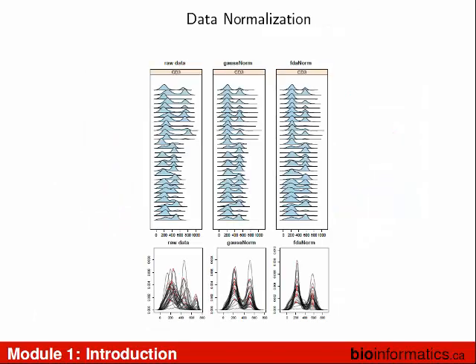So this is kind of how it looks. Again, not showing any code. You have to trust me that the math is really cool. This is what the raw data look like. So here's that population, and here's that other population. They're actually the same thing. We do the math, and now these are lined up on top of each other. We had two different ways, and essentially they work the same way.